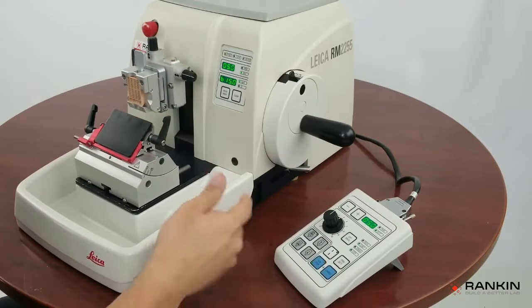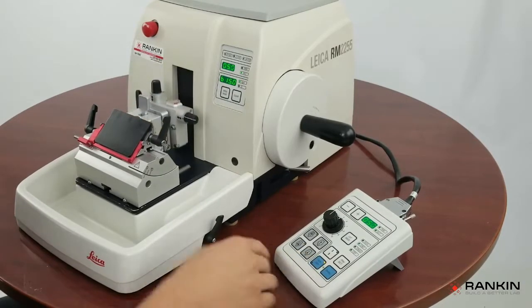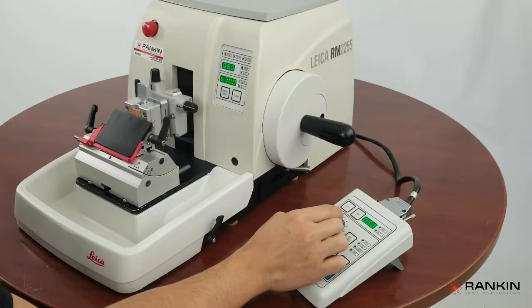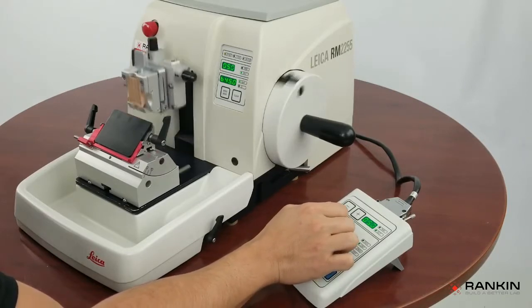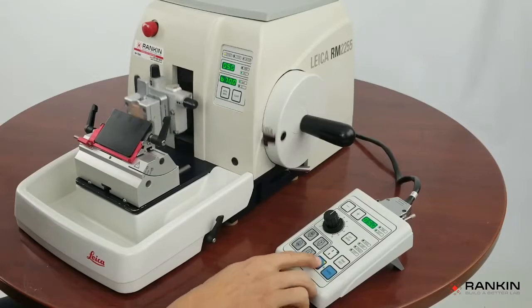I'm going to hit it and it will stop at 12 o'clock. In order to change the speed, you can do that on the fly or before or after it stops. You can go slower, you can go faster. I'm going to set it at 5 and then stop that.